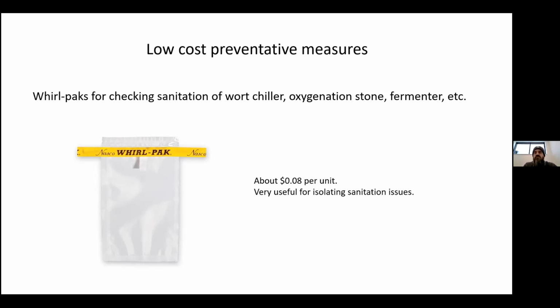If you regularly use these and you never see growth, you're doing a really good job getting everything sanitary all the way along your wort transfer lines. And again, very, very cheap. So there's not a great reason not to do something like this.